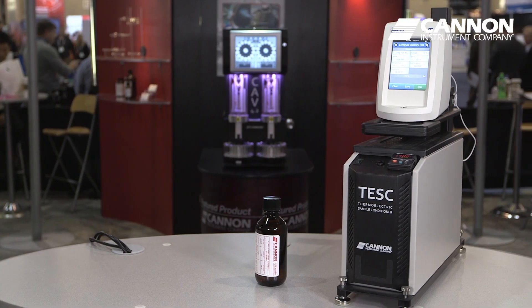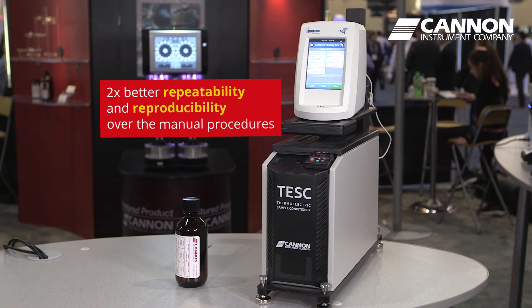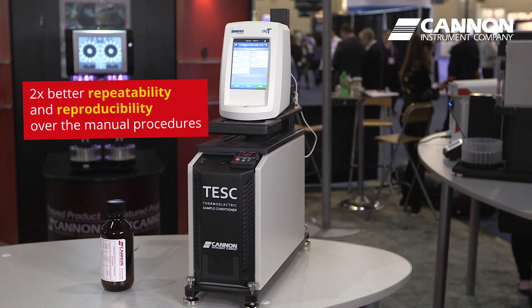In a recent ASTM round-robin inter-laboratory study, the precision of the TESC was found to be nearly two times better in repeatability and reproducibility over the manual procedures.